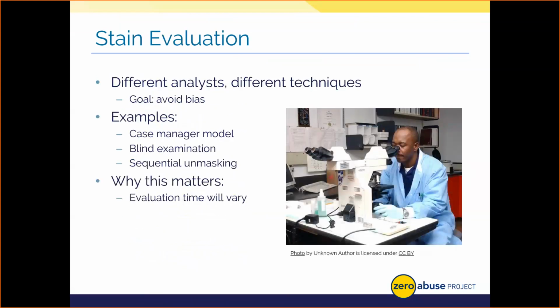Now, I want to spend then a few minutes to chat with you regarding how analysts go about processing items from a case knowledge standpoint, as how we go about looking at items and what we know comes with merits and challenges that can impact how long it might take to get your evidence results. Depending on the analyst, they may take different approaches to evaluating items from a case that helps them avoid falling prey to bias, such as, for example, contextual bias, where information pumped to them forces them to only look at an item for a given type of evidence.